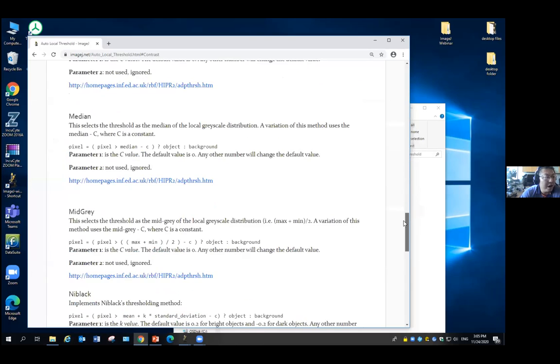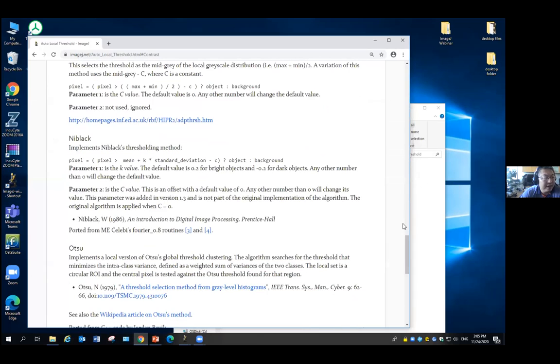Parameter 1 and 2 are different for every single method you use. Okay? And you just need to practice on it. Many times, you don't think about which value will be good; you just try different values to see which value works the best. I mean, subtract background and Gaussian blur, you can use them both together to reduce the background noise.